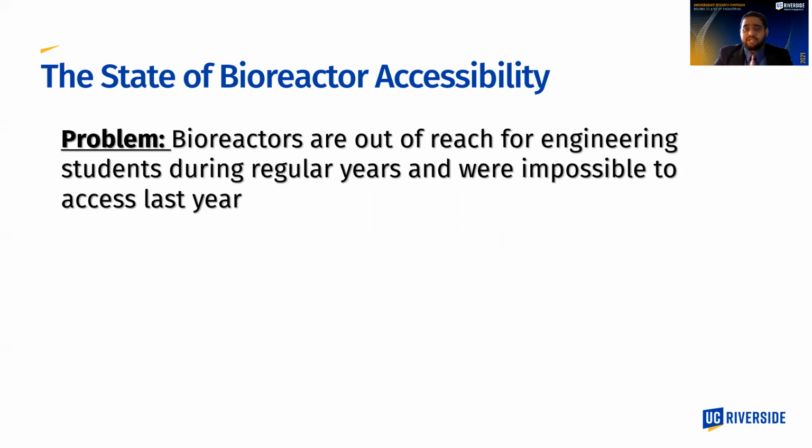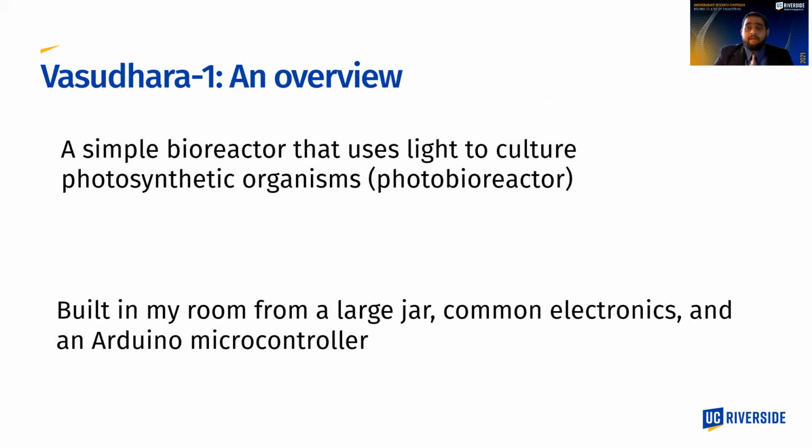So as a second-year bioengineer, and perhaps at the most ripe time of my undergraduate degree, how would I have access to this incredible tool? Well, it's simple. I'd make my own. And here's why I introduced Vasudhara 1. Vasudhara is the name of the Buddhist deity of abundance, in reference to how a bioreactor grows many organisms from a single starter culture. It is a simple photobioreactor, photo meaning light, and uses light to culture algae. I built this in my room using a large fermentation jar, common electronics, and an Arduino microcontroller. Additionally, I sadly had no funding for this project.